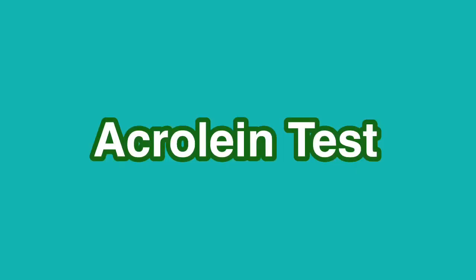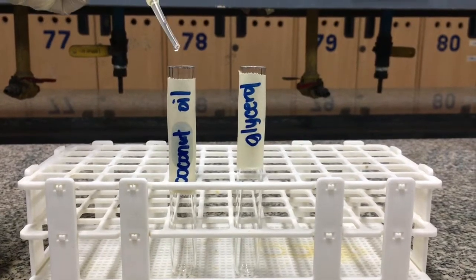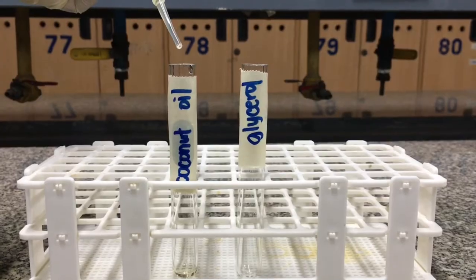Now, we will do the acrolein test. It is used to determine the presence of glycerol, and since triacylglycerol contains a glycerol backbone, this can also be used to determine its presence. We will be subjecting coconut oil to the acrolein test. At the same time, glycerol is also tested as a standard.